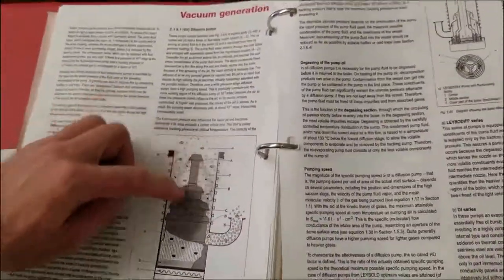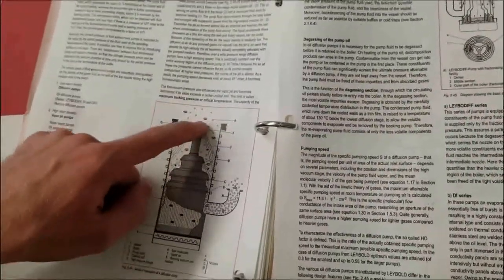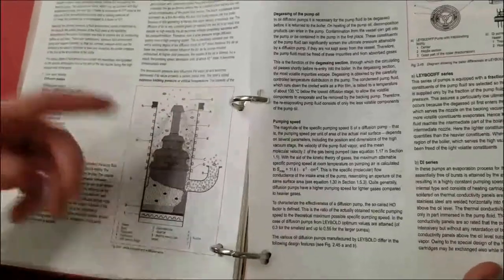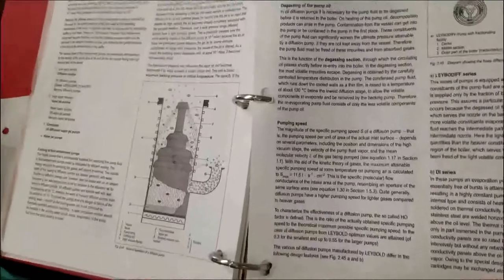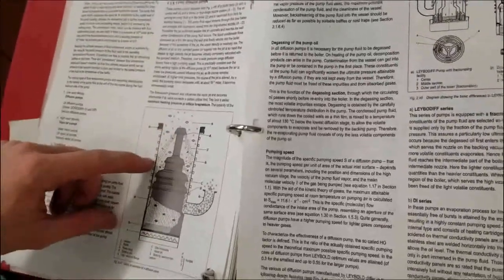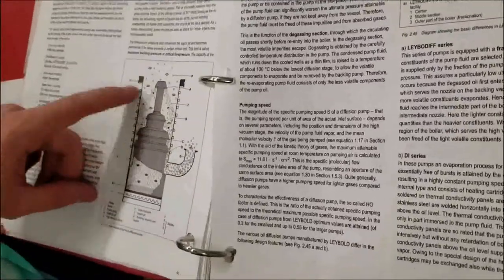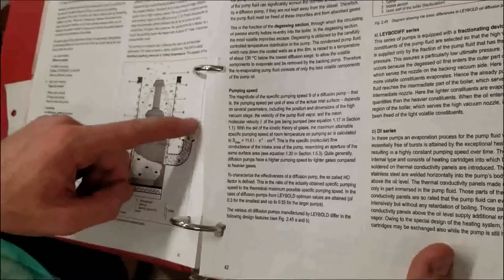It's got these cones up here, it boils oil down here. The oil shoots up into this thing and knocks air molecules down because at very low vacuum we're in a regime where the idea of flow in air doesn't exist anymore because there's not enough particles. So they get knocked down, the oil instantly condenses when it hits the side of this container and flows downwards, and it just pushes the air molecules out this vent over here.